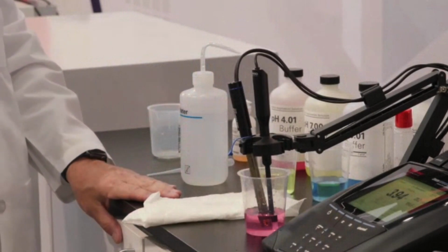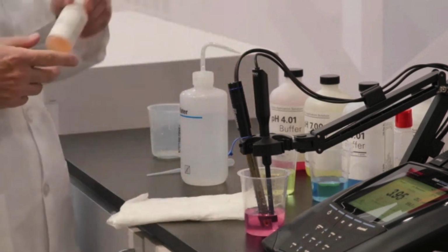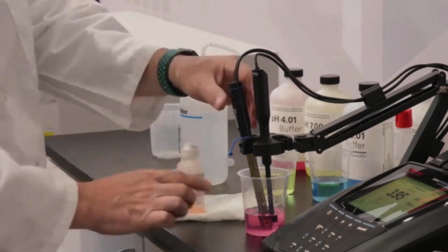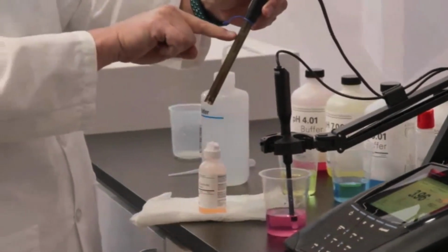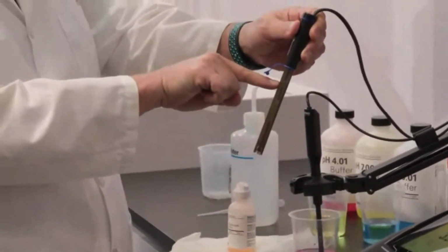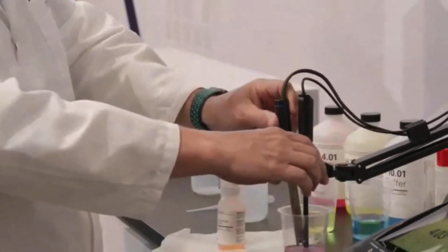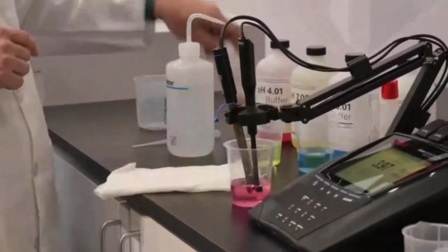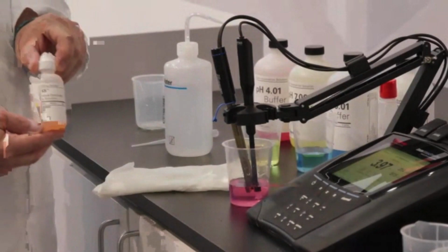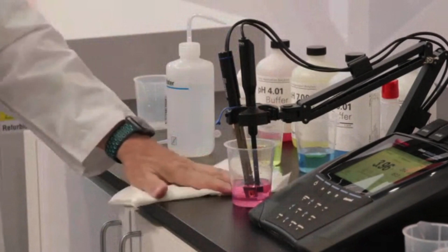Now, just before we calibrate, let's take a quick look at the electrolyte fill solution and make sure that we have plenty in there. Steve probably already did this, but if you can just show that to the camera, Steve. Yeah. So there's fill solution inside the electrode. He's pointing there. We want to make sure it's filled right up to the top at the bottom of the fill hole. And he would use that Ross filling solution that came with the electrode. So it's important to use the right fill solution. That's great. Thanks, Steve.